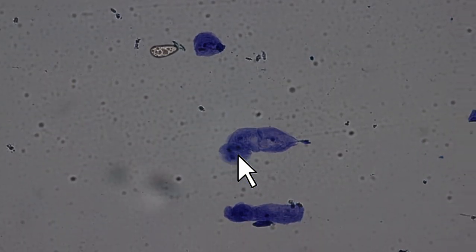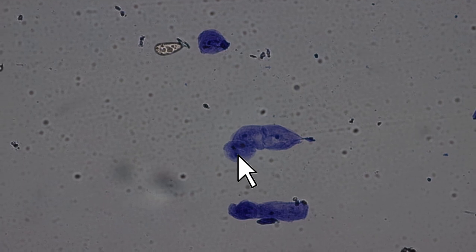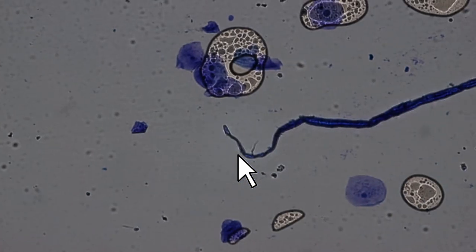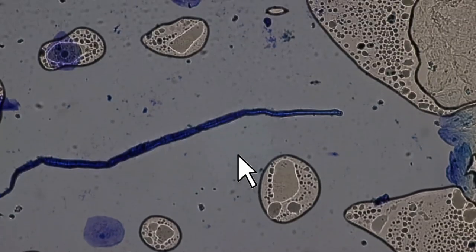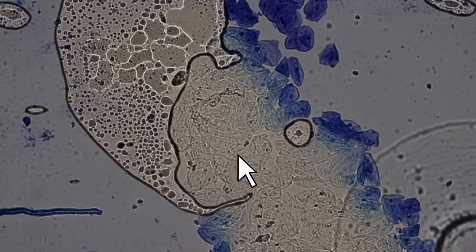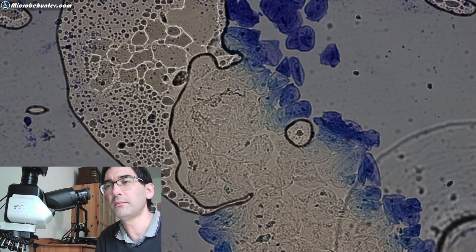Okay. And you can also see very carefully that the nuclei are actually much darker than the surrounding cells. The surrounding cells, I mean, the cytoplasm, the rest of the cells. So again, you can also see here, this is actually also quite a nice one. Over here in the middle, these are non-stained cells. These are non-stained cells here in the middle.